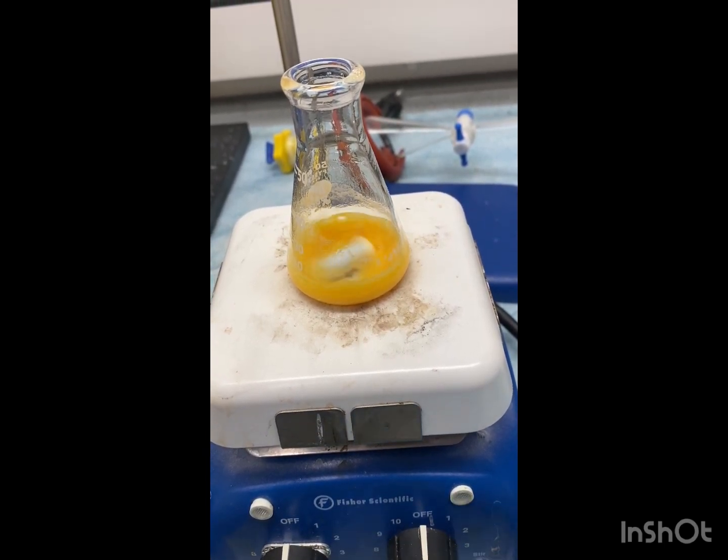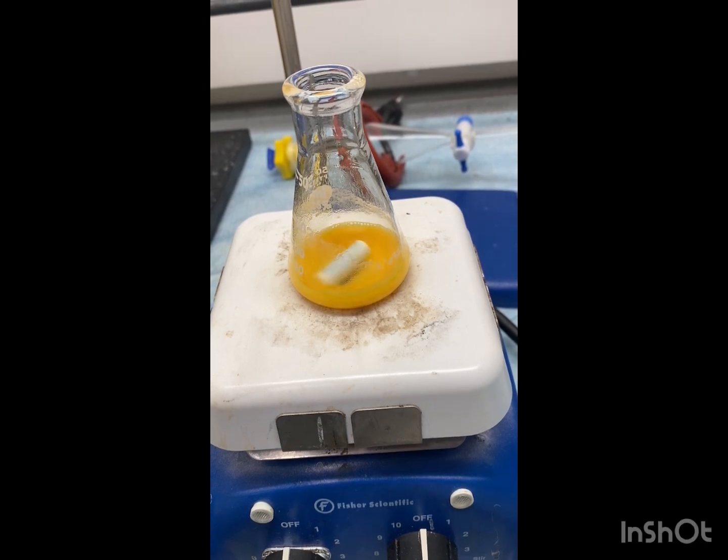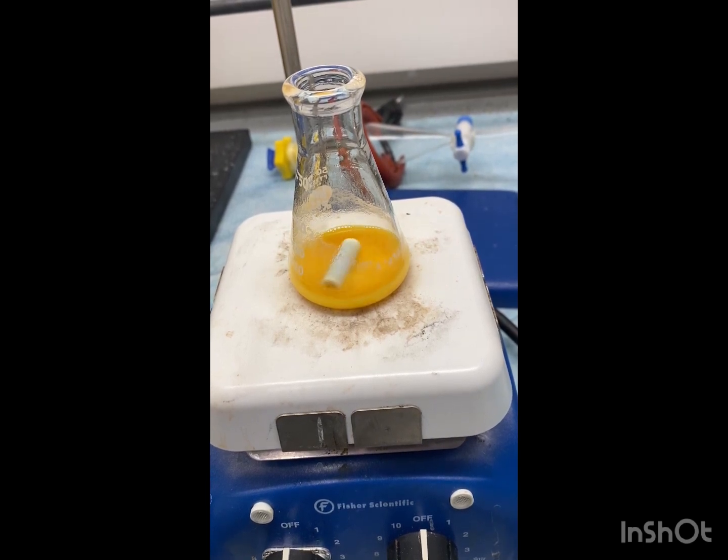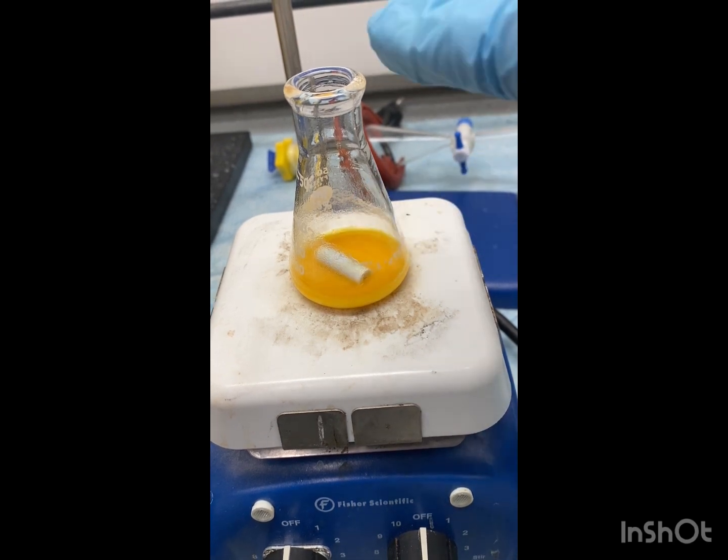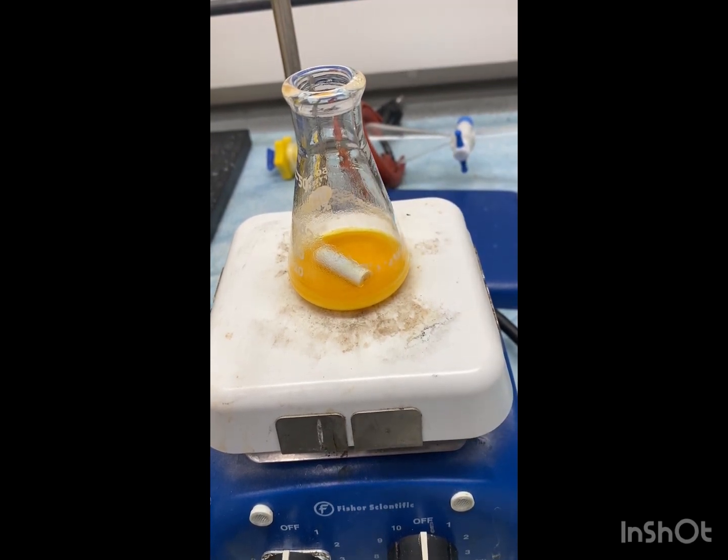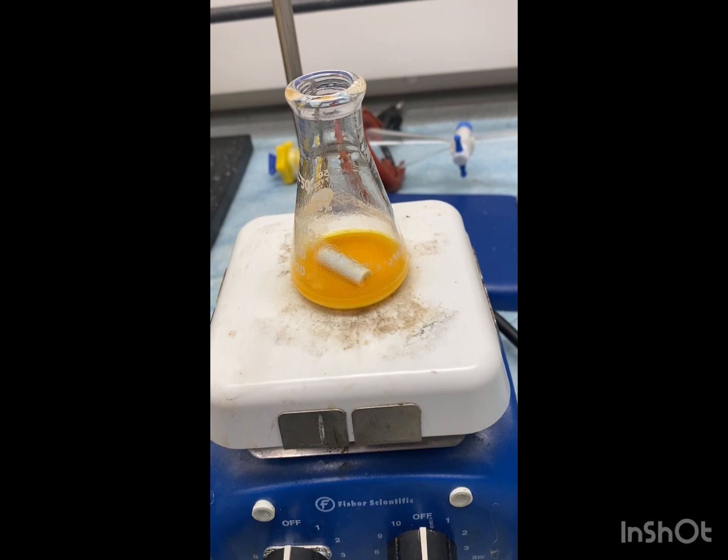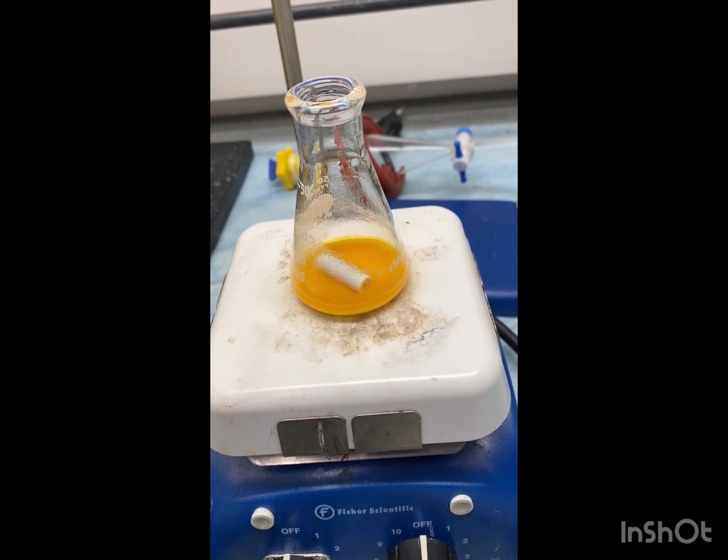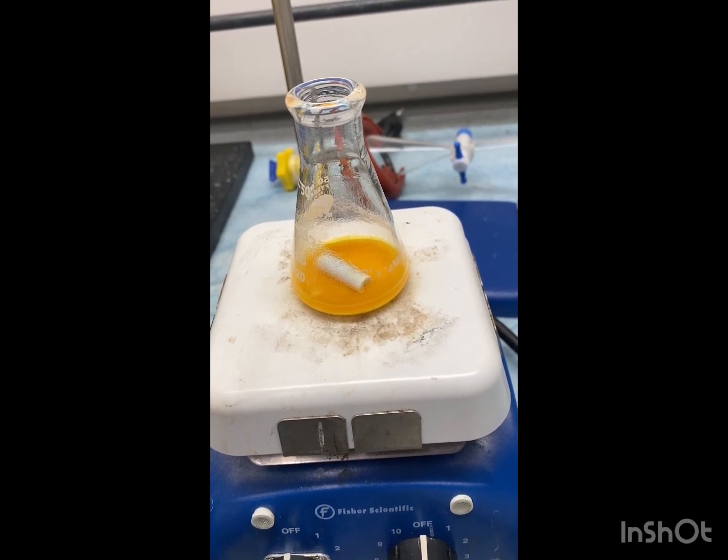Turn our stir off. You want to be careful, you might want to get hot hand gloves cause this could be pretty hot, but we're going to remove it from the heat and just let it cool to room temperature. And once it's cooled to room temperature, we're going to put it in the ice bath for a few minutes.